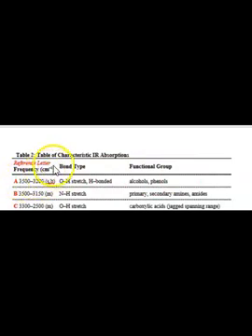Okay, so let's take a look at this first one here. It says this frequency, and it says centimeters inverted or inverse centimeters. Well, instead of using hertz, for example, it actually turns out to be very convenient to use inverse centimeters. And what that means is how many waves you get per centimeter. It's really just a different way than you might usually use in high school physics or high school chemistry. So in this method, inverse centimeters means that you can fit 3,500 infrared wavelengths in 1 centimeter. That just makes this scale convenient in size, so we can use these numbers here.